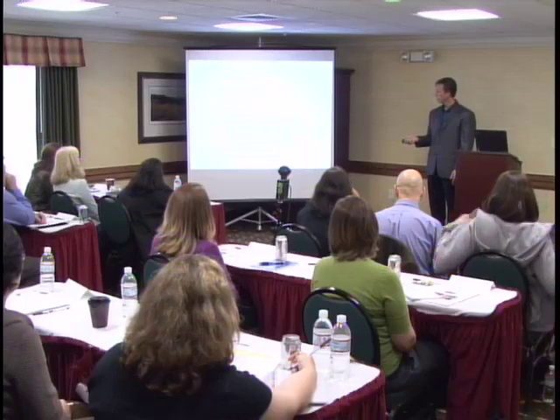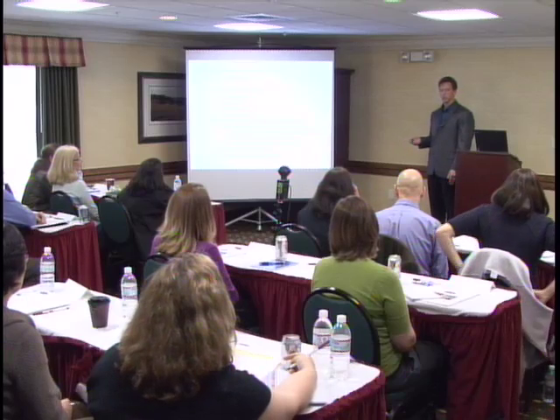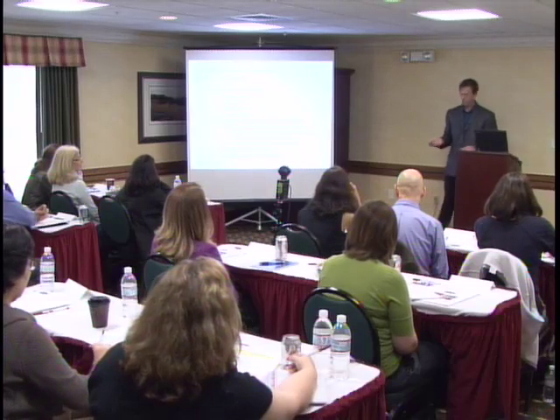And what's become very interesting, I'm just going to introduce it, and then John's going to go into what it actually means and what's interesting about this. There are a lot of polymorphic alleles out there. There's a lot more alleles than you see with traditional typing. And I'll just show you what the data look like.